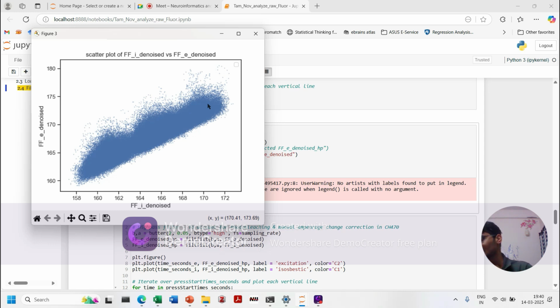So this is a known fact. This particular sensor also can't detect the dips. It detects the higher concentrations better than the dips. So this is a function of both dopamine signaling as well as our sensors, that you see a lot of positive signal present instead of a negative signal.